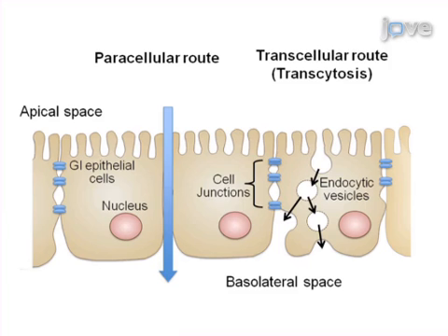Finally, to investigate the mechanism of transport, similar experiments must be conducted in the presence of pharmacological inhibitors of transcytosis across cells or with reporters of paracellular transport between cells.